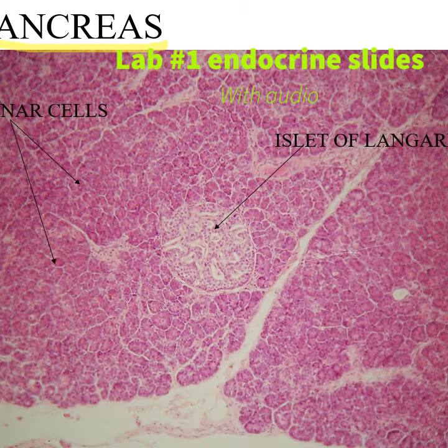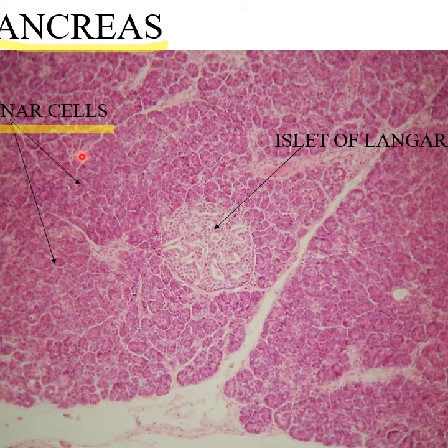It's both an exocrine and an endocrine gland. Now, the exocrine portion of the pancreas we'll look at with the digestive system. Most of its volume is made up of these cells that are exocrine cells or acinar cells or acini. These are the darker cells that you see all out here. If you look at them closely, they're arranged around a little duct that eventually leads into a larger pancreatic duct, which goes into the small intestine. So we're not too worried about that for this section.